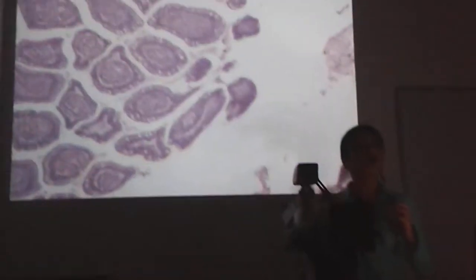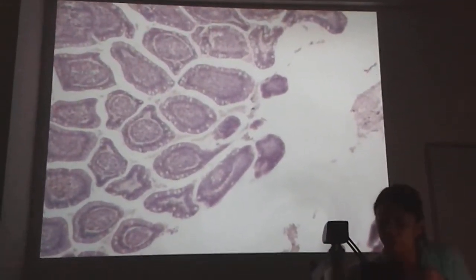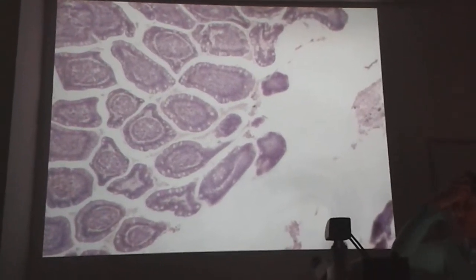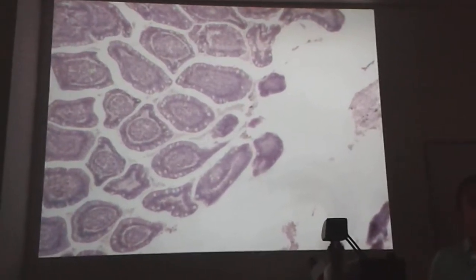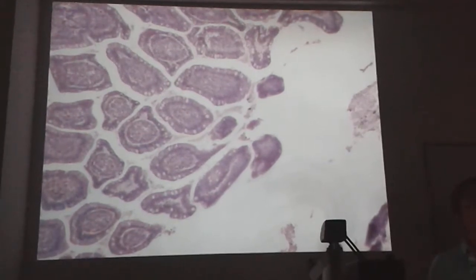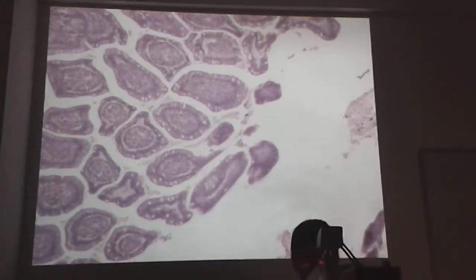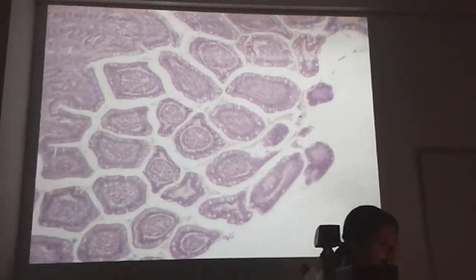And after this, in your lecture, you have also learned about mucosa-associated lymphatic organs, because these lymphatic organs can be found all over our body, and these are associated with our mucosa. In this example, I'm showing you an ileum section from our gut, and this lymph follicle is found in the ileum. So it is a gut-related lymphatic organ. So this is the epithelium.